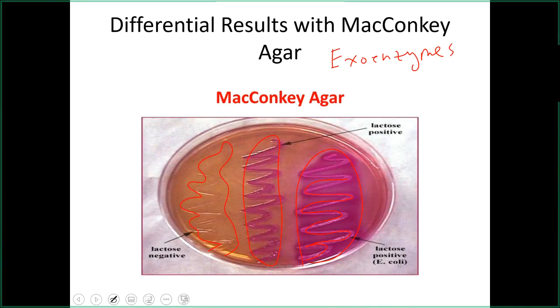You're looking right through the growth at that agar, so it's clear. And so the organism can grow on this, but it's not fermenting the lactose. There's other things it's using to get by, and it's able to withstand, that is, it can overcome the inhibiting effects of the bile salt. This might be Salmonella. All right, might be Salmonella that's growing in that situation.